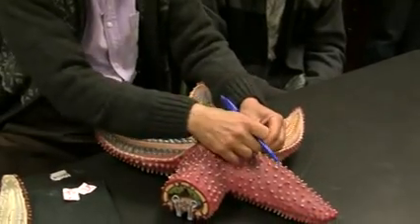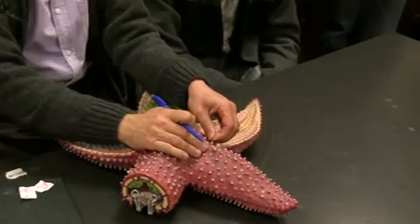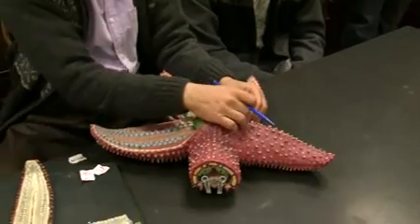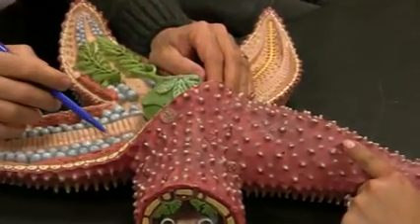Then pedicellaria. You do have a slide. I don't know why I didn't have it on my slide. Did you show the eye? Can you show the eye? These are eyes. Oh, those are the red ones, right? Yes, the red ones. But today I don't know why I did not have pedicellaria. I forgot, I guess, to put it. Pedicellaria, right? Wire-looking thing.